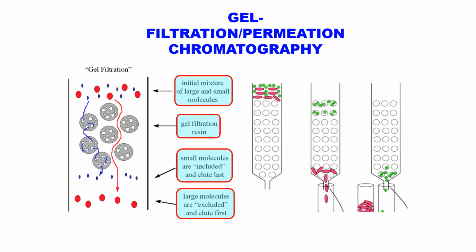So what is done is that the eluent, or the mobile phase, is collected in small volumes called aliquots in separate small vials, and it is expected that one vial should contain one type of molecule.